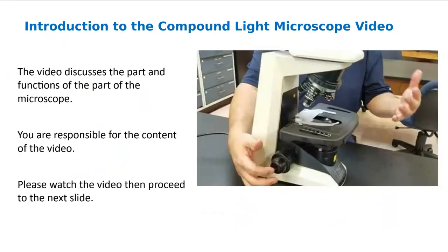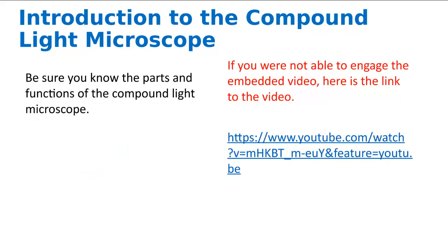Okay, so I have done a similar thing, but this is me talking in more detail about the microscope. And so this is a video. It's embedded in this particular presentation. So if you want to look at it, you can try to look at it in the presentation. If not, because some computers won't let you do that, I've placed the link to the video here, and so you can copy that link, put it into your browser, and you will find that video on YouTube. Okay, and you can watch it.